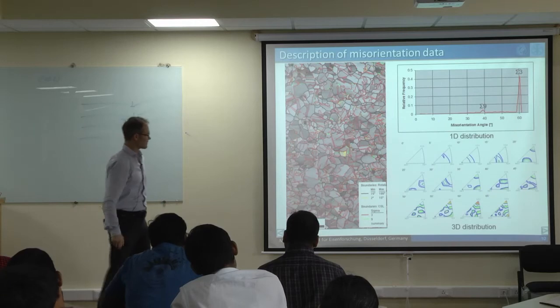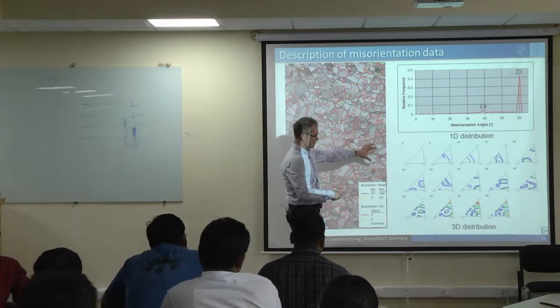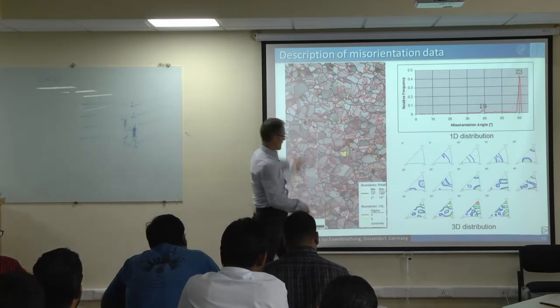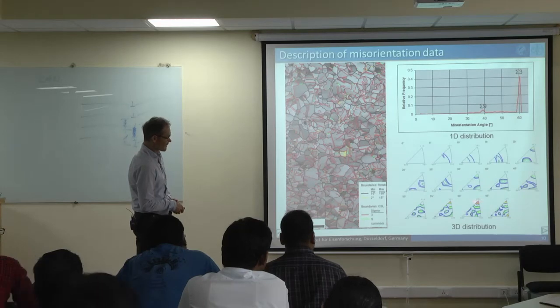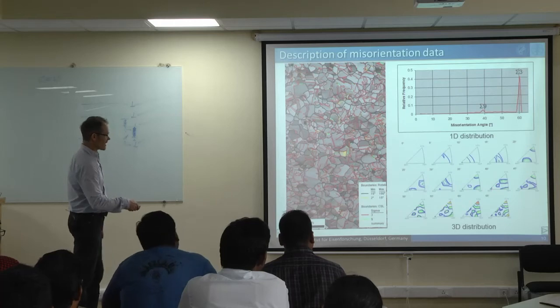You maybe remember it from the Rodrigues story. We are plotting these angles, and for each of these angles, we are plotting which axes appear in this map here. And then we see, for a long time not much happens, but when we come to 60 degrees, we see a strong concentration here in the corner of 111. Yeah, so that obviously indicates that there is something special happening.